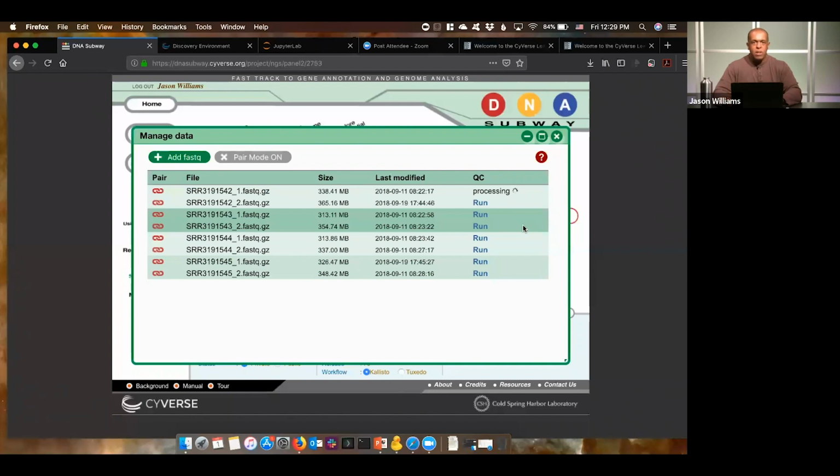I'll also mention here that you're limited to a number of concurrent jobs. So the more files that you have, at a certain point, you'll have to wait for some to run before you finish. In my case, running these over the last couple of tries has taken about 15 minutes to get through all of them. Maybe I get through 3/4 of them and I'm over my job limit. I waited 5 minutes and then I could continue. This is mentioned in the documentation, which I'll point out to you, but just have in mind that you can't run every single thing at once.